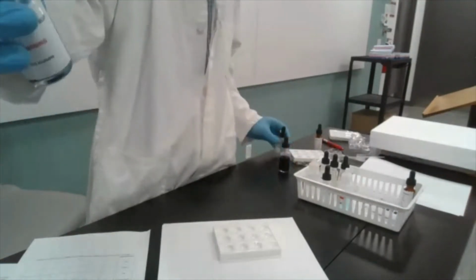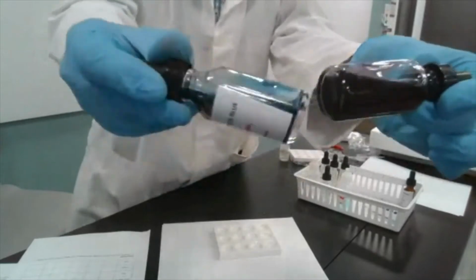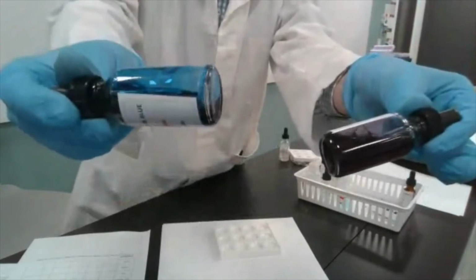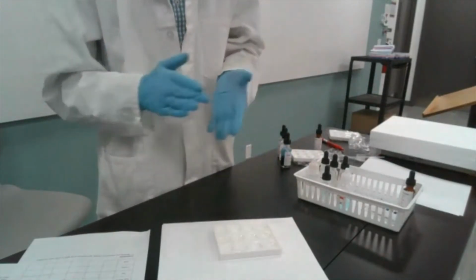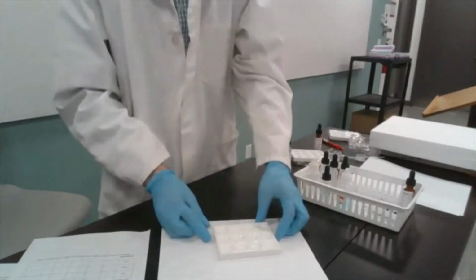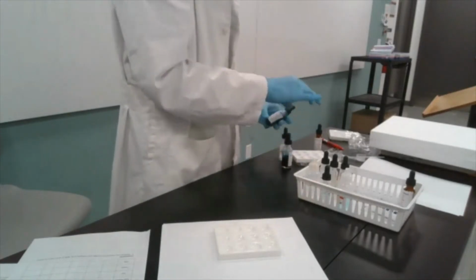So this is a difference for you: this is a synthetic indicator, and this is derived from a plant. You see the difference, even though they both have blue in the name, the color of the synthetic versus the natural is quite different. But it shouldn't really matter because we know what the color change of each indicator is. Or if you don't know what it is, we'll see when we test these first three substances. So let's add the indicators to distilled water first. Oh, and I didn't show you the last one.